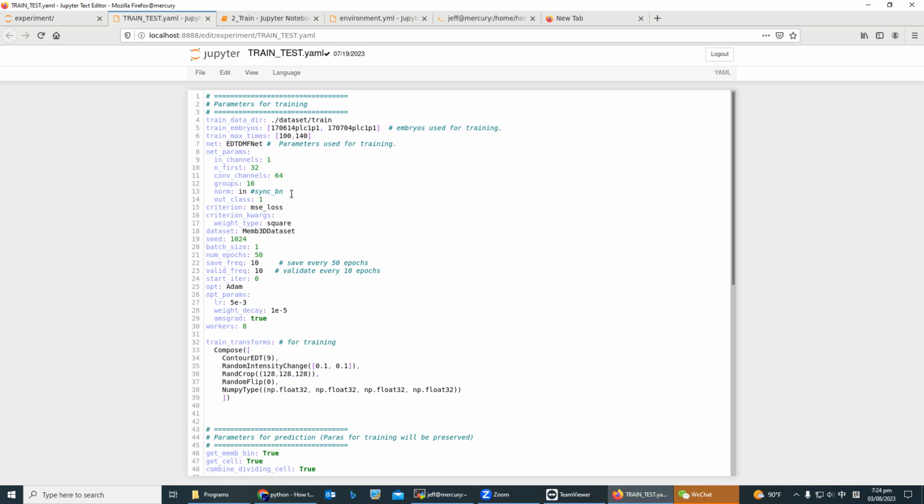You don't need to have a consistent time point for one training embryo, it will read it automatically. You just need to make sure the max time is already over the real training embryo you have. For example, for this embryo, the max times is 93, and then you put a number larger than 93. That's fine.